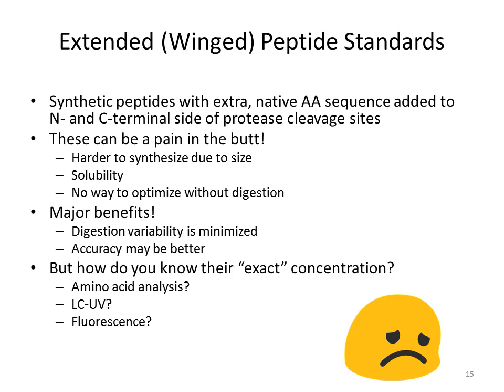And so you're hydrolyzing your protein or peptide into amino acids. Then you separate the amino acids on a very well characterized method that uses either fluorescence or UV detection. And then you look at the peak areas of each of your amino acids from your sample and compare it to an external standard of those amino acids, compare the peak areas.